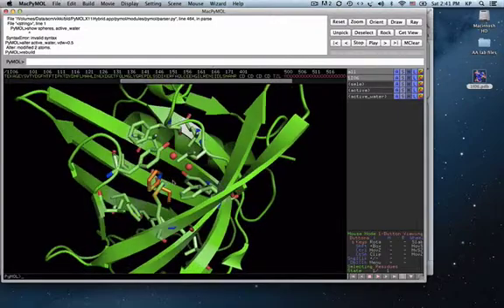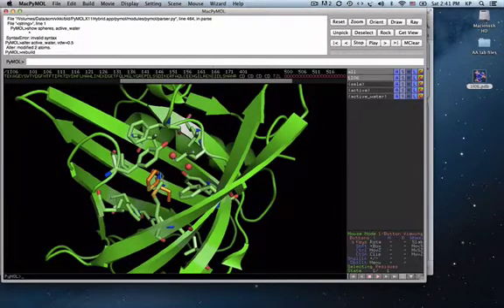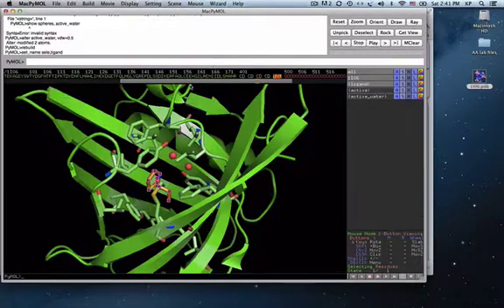And now I want to show how this interacts with my hydrogen bond network. But what I'm going to do first, if I start selecting other things, they'll add to this selection. So what I'm going to do in my actions is rename my selection. Now when we defined the active site by typing in here, it showed up as its own selection. However, we can just select things from the code and rename them to define them as their own selection. And I'll call this one ligand.